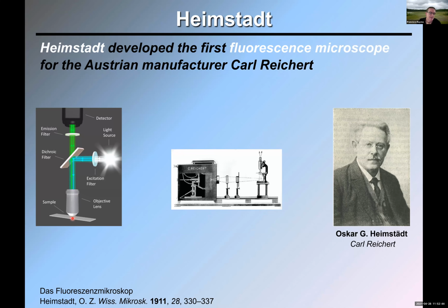So the molecules there would absorb the incoming light, and then the fluorescence would travel back through the objective lens all the way to the detector. And notice that the excitation source and the detector are on the same side of the sample, okay? And when detector and excitation source are on the same side, the term epi is used. So this will be an epi illumination microscope.